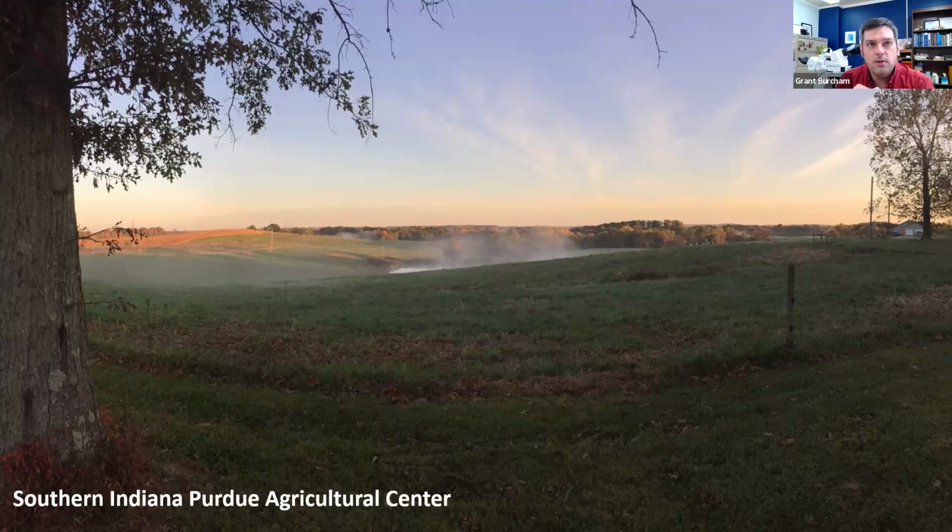At the lab here in southwestern Indiana, we're doing mostly livestock and poultry, and that's why this lab grew up, because of the heavy poultry populations here in the southwest part of the state. We're probably 85-90% livestock and poultry here. In West Lafayette, because of the proximity to the teaching hospital, they do a lot of companion animal diagnostics, so it's much more heavily tilted towards companion animals.